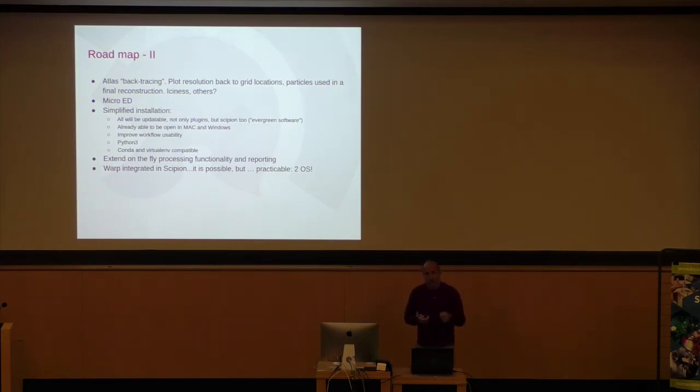We will also extend the on-the-fly processing functionality and reporting. Our report now stops at CTF, but if you do some picking or 2D classification, you cannot see it in the report. So we will probably extend the report and you will be able to see what has been picked by the pickers or how the classes look.